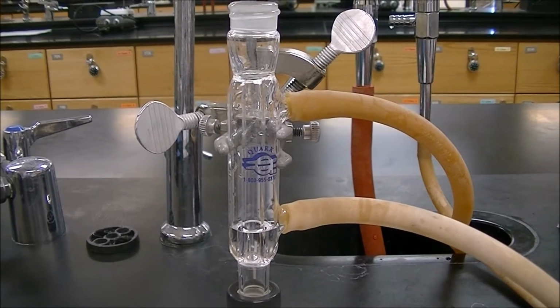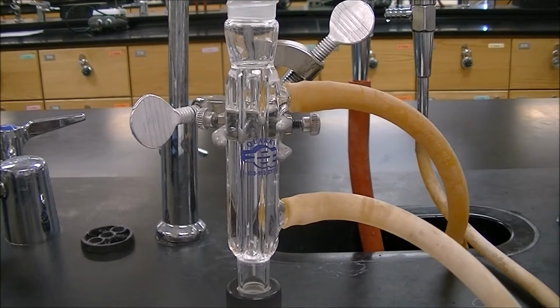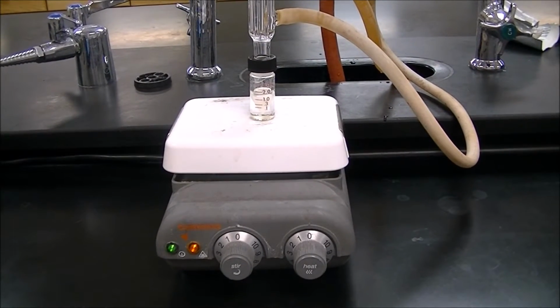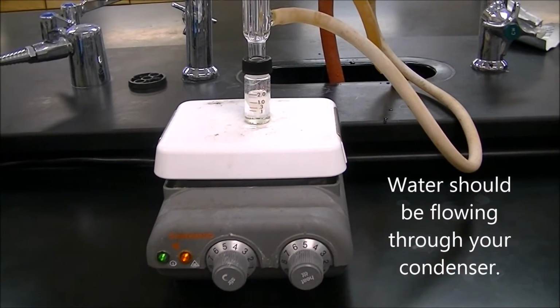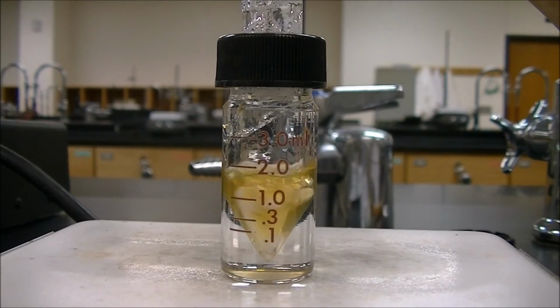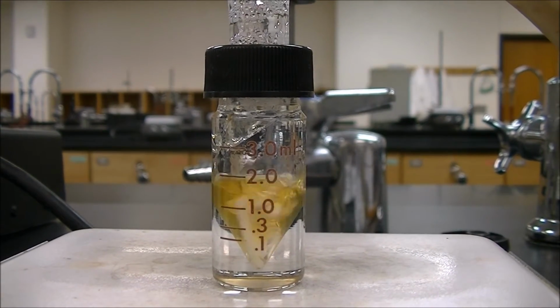When you turn on the sink, you should be able to see water running through the condenser. Begin refluxing: turn on the heat and the stir. While refluxing, you should notice that your solution turns a yellow-orange color and that it starts to condense down the conical vial.